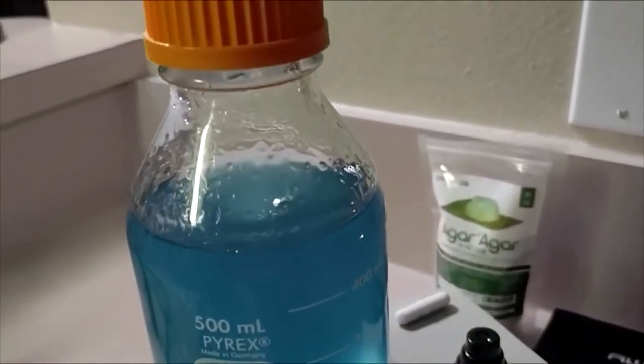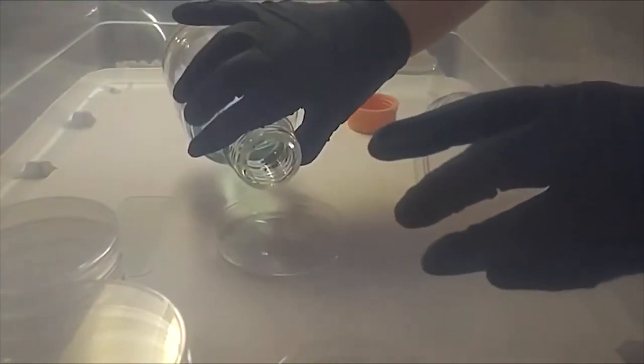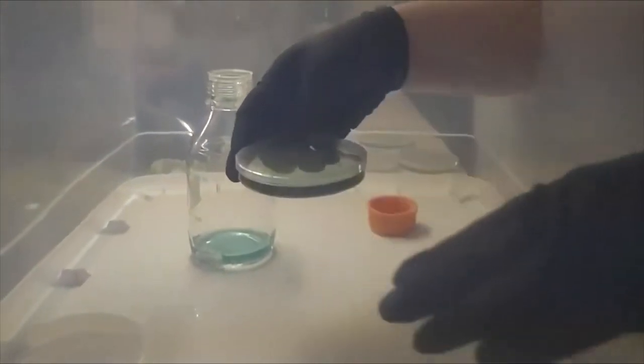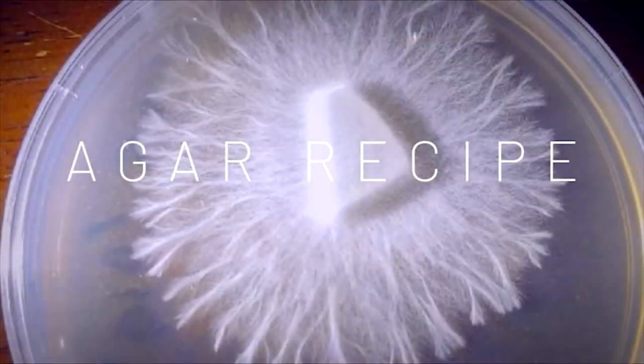Water agar has proven for us to be the best recipe when dealing with spores and clones. The idea behind water agar is to give just enough nutrients for the mycelium to branch out while giving very little nutrients for contamination to grow. The resulting growth is generally enough to be able to transfer a clean sample to a more nutrient-dense dish to continue the transferring process.